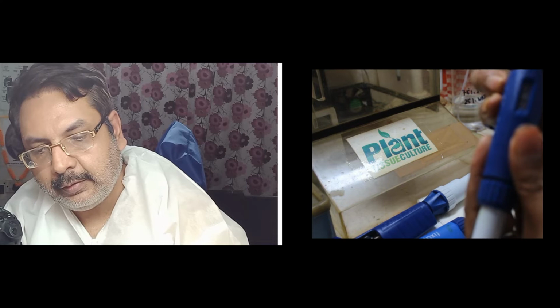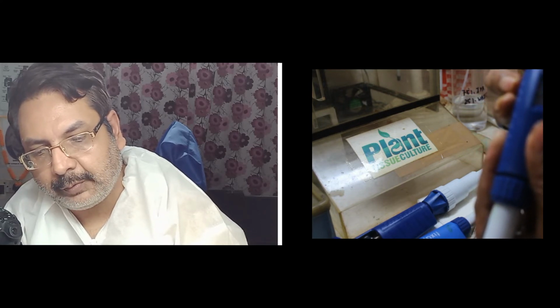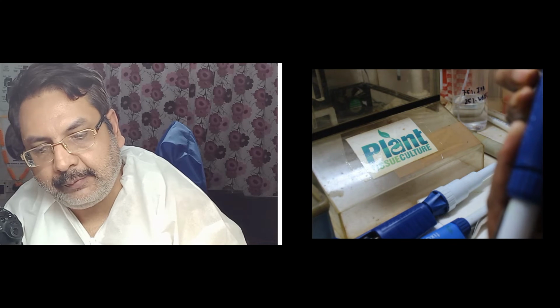This is a dial and this is the knob, by which you can move the dial, and with the dial you will be able to set the volume of the auto pipette. So now it is 500 microliter, 050. Sorry, 50 microliter. This is 50 microliter.